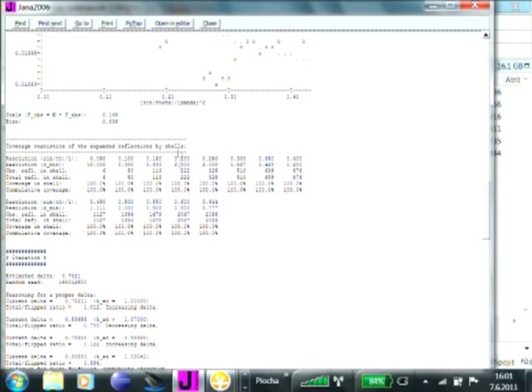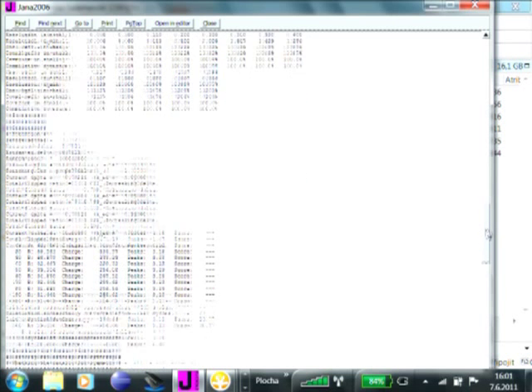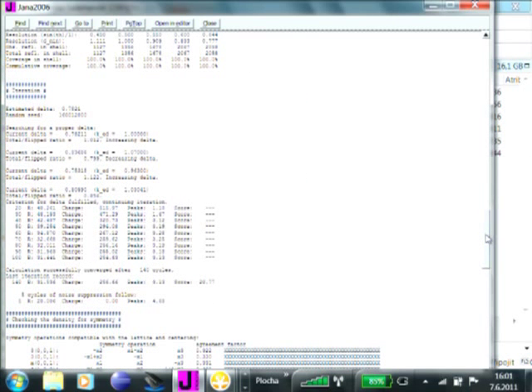The next table is the coverage. Well, in powder diffraction data, you have 100% coverage up to the highest resolution that you choose. And in this case, it's really high resolution. So the coverage is not a problem for powder diffraction data. Now I recall I didn't comment on coverage for the electron diffraction data, but for this data set, the coverage was about 95%. So it was a fairly complete data set.